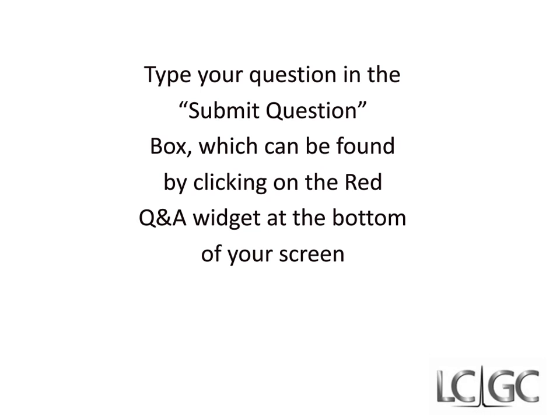Okay, thank you again. I'm just trying to catch the next question or see if there's any more. Someone wants to know, what is your experience with HILIC chromatography in a high throughput setting in regards to doing long equilibration times and extensive organic solvent use?